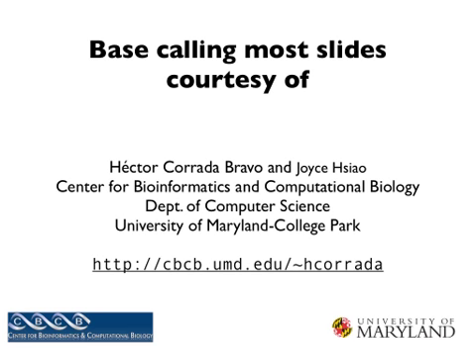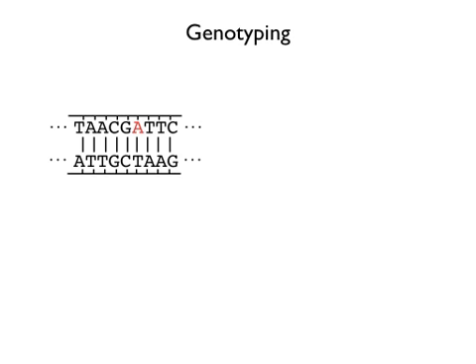Okay, so now I'll talk a little bit about base calling, so how it happens that you get calls, you get sequences from intensities. This is a very hard topic to do research in because the files are really massive, and these days most technologies are erasing the intensities as they convert them into sequences. That's how big and problematic they are.